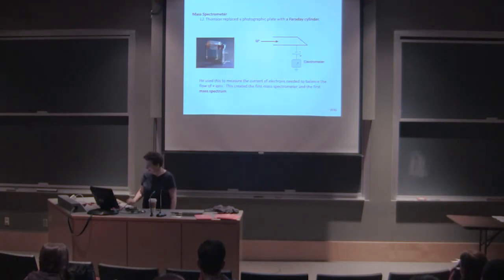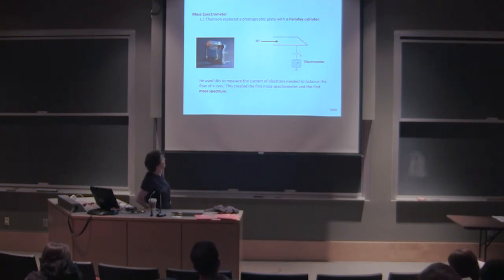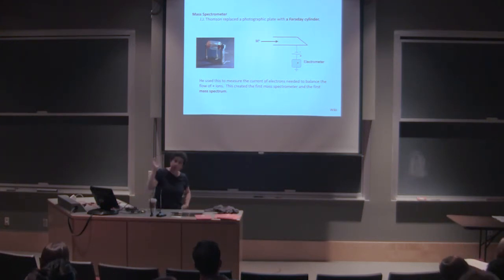Okay, this is an illustration of the circuitry of a Faraday collector. I just want to say a couple of things about how we handle signal processing slightly differently in these instruments.